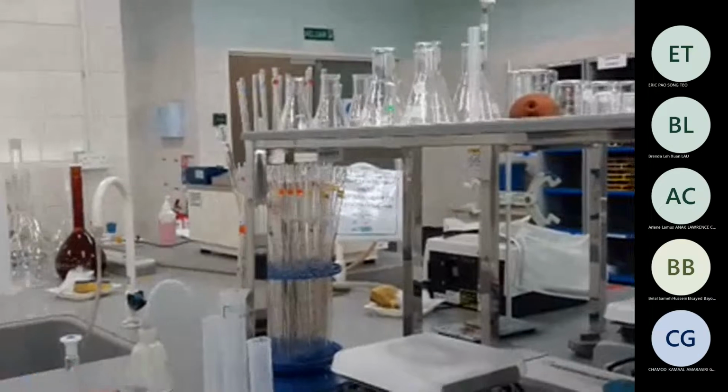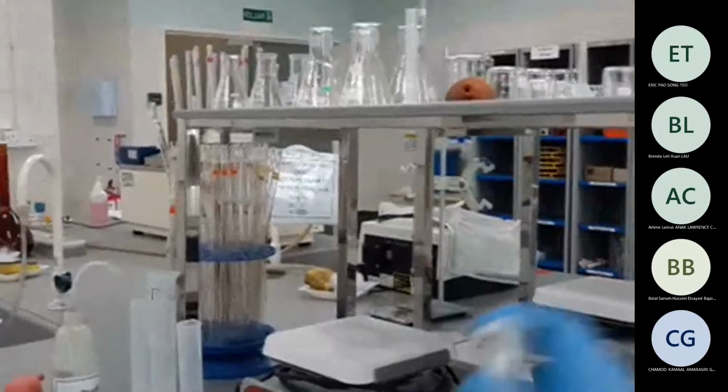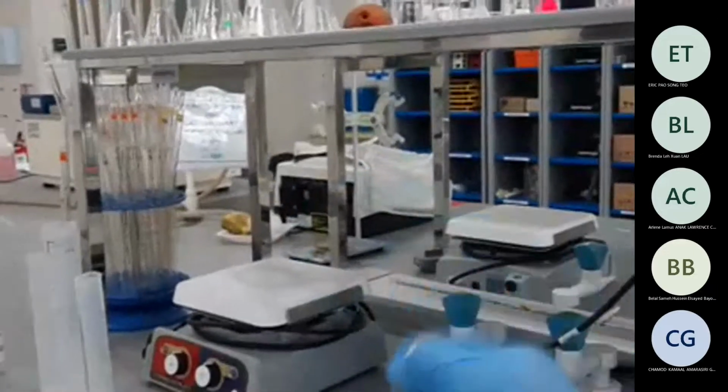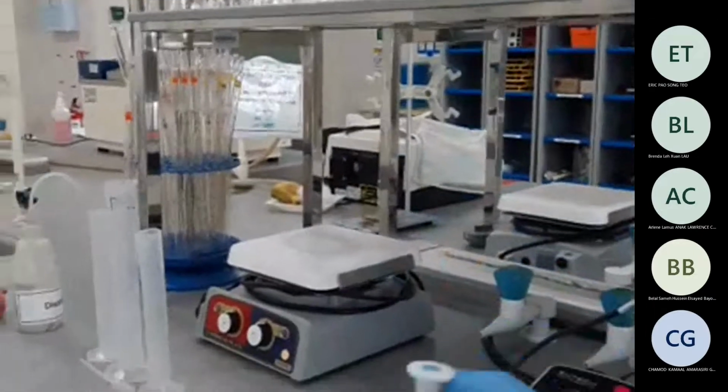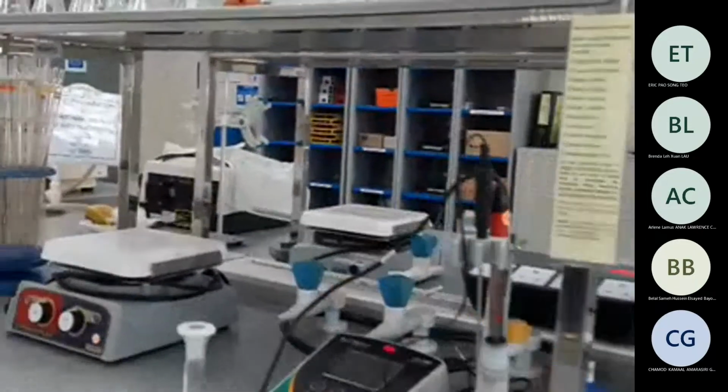I mean, put the cap on, and you need to swirl it for some time, 2 or 3 times, invert it a few times so that it mixes well everywhere, the HCl and water molecules together. Okay, so hopefully it is nicely mixed. Now do the same for ethanoic acid.